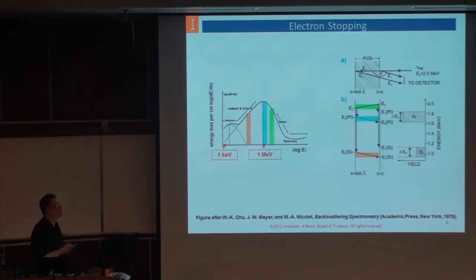Now if the ion travels through the sample, it's losing energy, losing energy, losing energy, has a backscatter event, drops that same amount, this size and this size are the same, and then it comes back out. And so now it has a lower energy than the backscatter event that occurred at the surface, and from that information we can determine thickness. And the same thing off the silicon. So we actually get a signal from the whole region there.